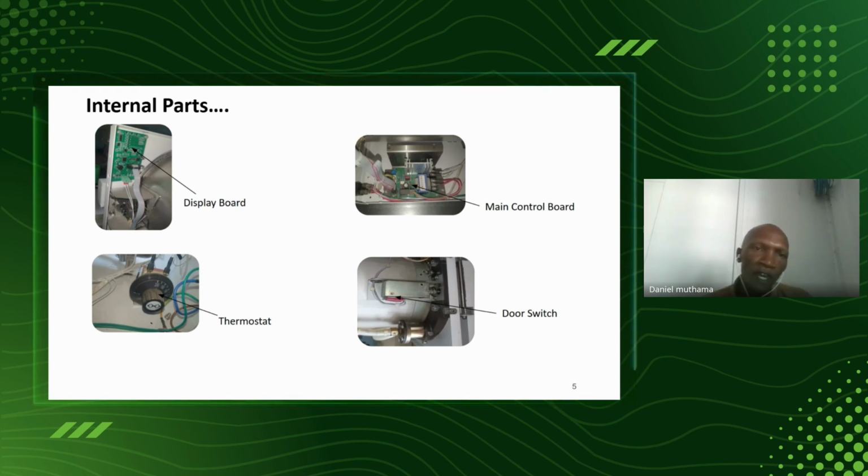And then this is the cable, which is connecting the motherboard to this board here. This board here is connected to this. This cable here is connecting the main PCB board, this one, to the display board.